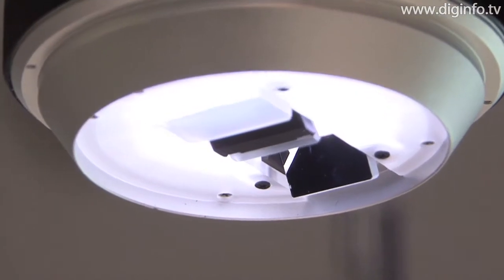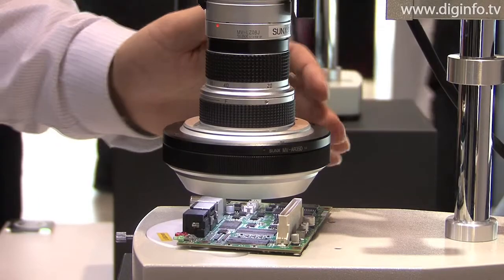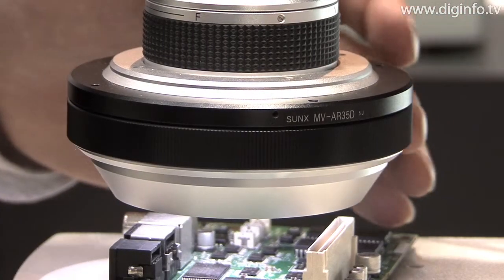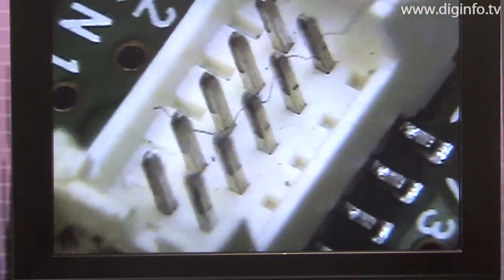The MVS series is also equipped with a master view function that draws a marker on the image, with a live measurement function that can be used to take measurements while observing the sample, and with a direct report function that can be used to create Excel reports with just one click.